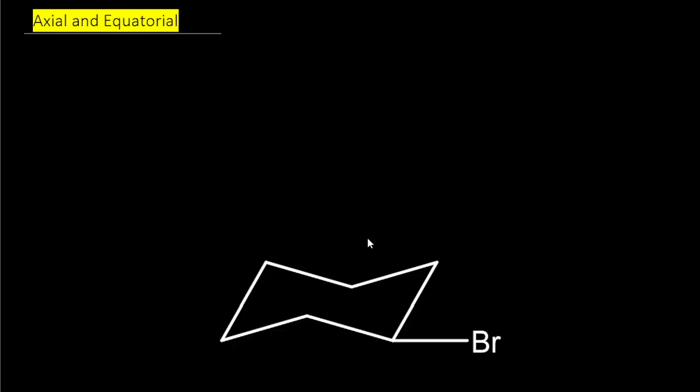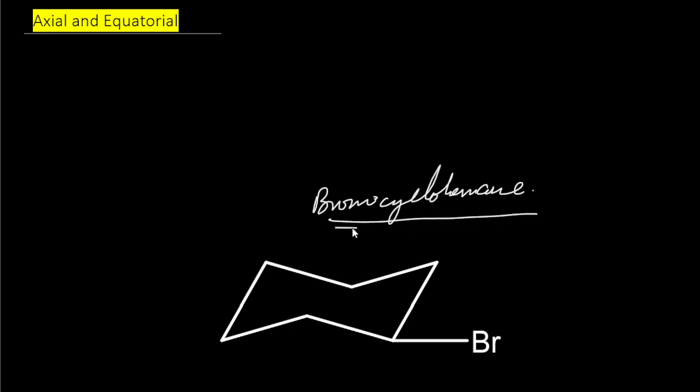In the next one, this is actually bromocyclohexane. Not a reaction, but it is a molecule that is used as a study in NMR.